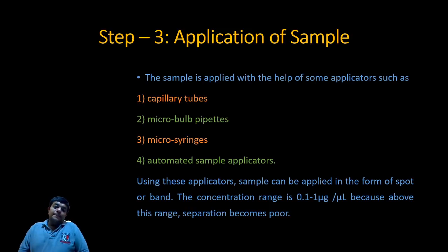When we apply, we might add a little bit larger quantity, but we need to add, highly carefully, a very small quantity with a very low concentration. Otherwise, adding a highly concentrated spot will make the separation very poor. And we can say with surety that a machine can do this better than we can.